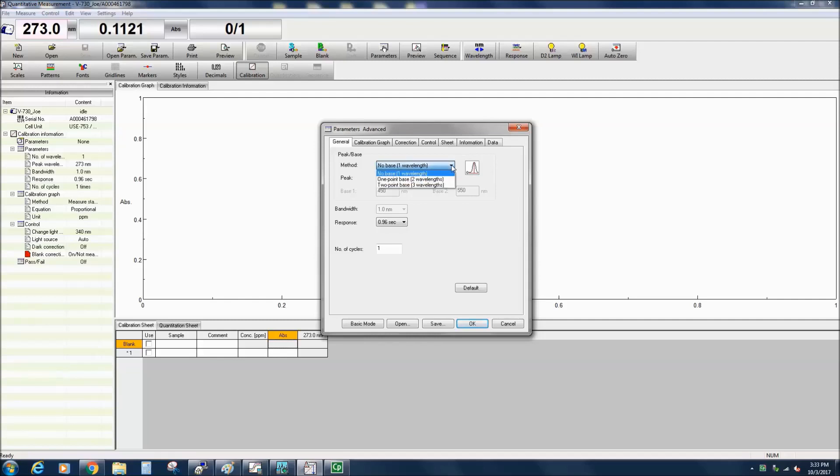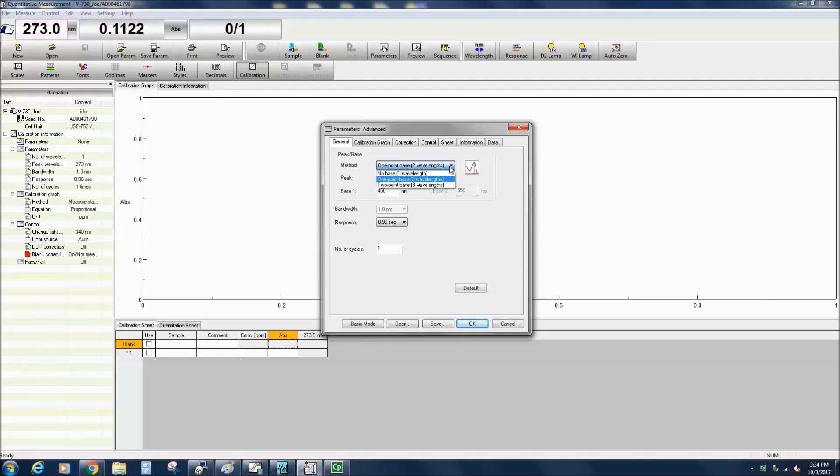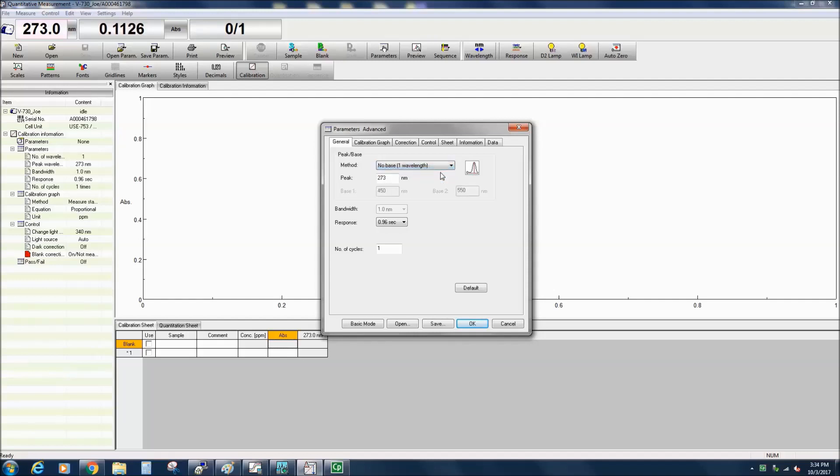There are three quantitative method options. The NoBase method uses the peak absorbance at a single wavelength. The OnePointBase uses the peak and baseline wavelengths. The TwoPoint wavelength uses three wavelengths for samples with inclined baselines.